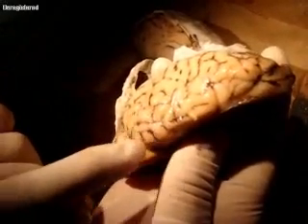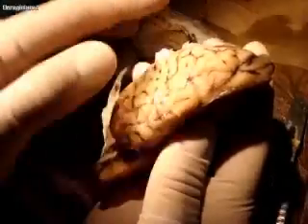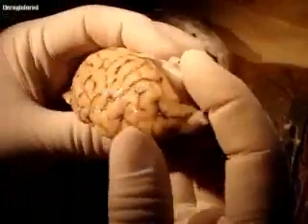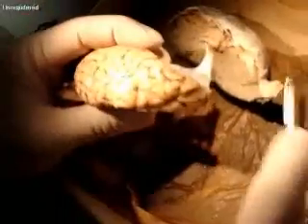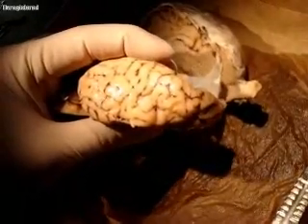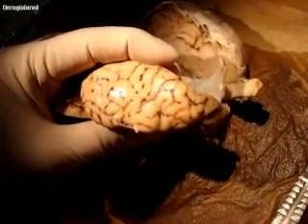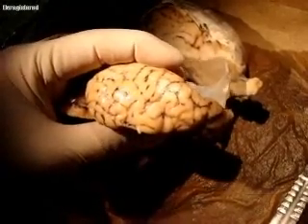And you can see this brown material represents blood vessels that are going through that portion of the brain. This outermost surface of the brain is kind of hard to see. I don't have a... Somebody have a... No, I don't need a probe, I need a hemostat. Somebody I can pull with. I'm not sure if it'll work, but it kind of looks like it might.